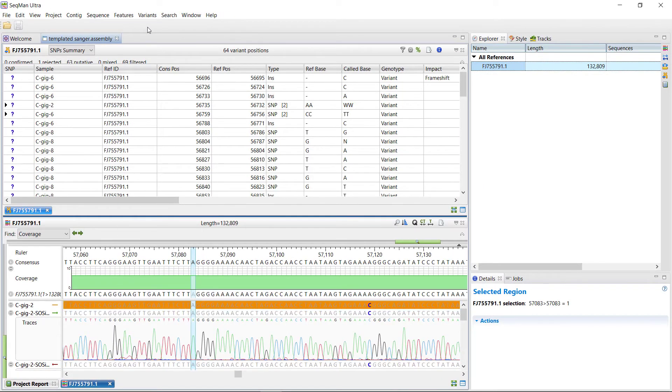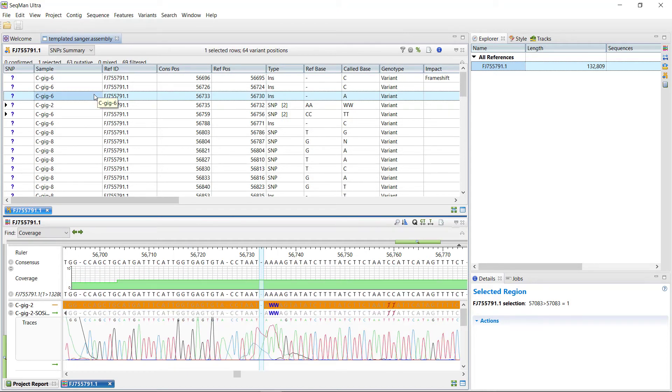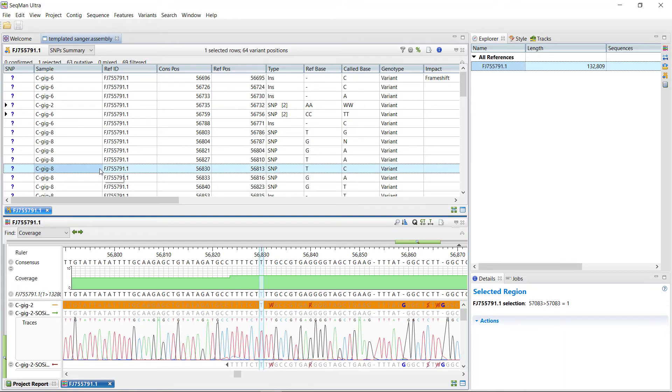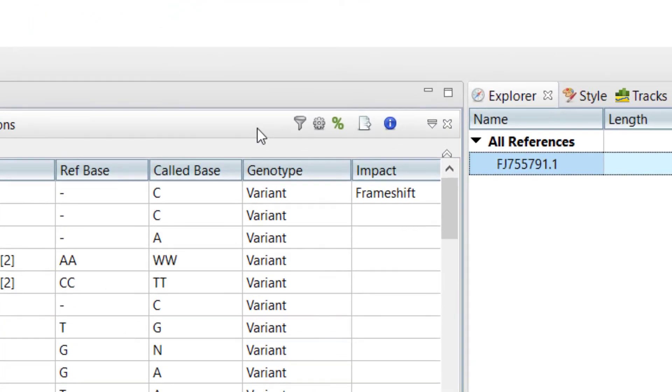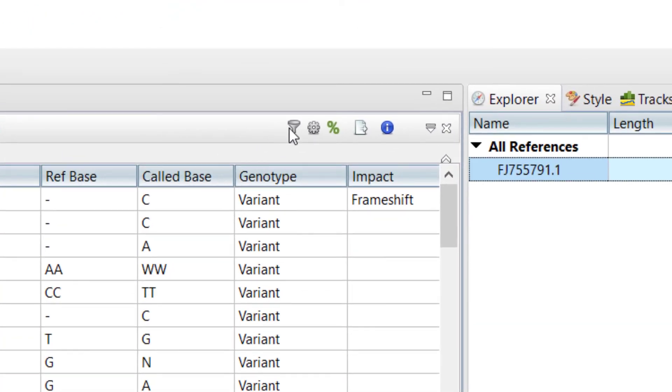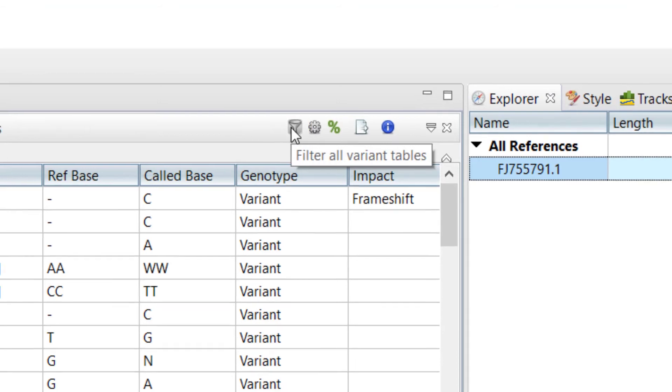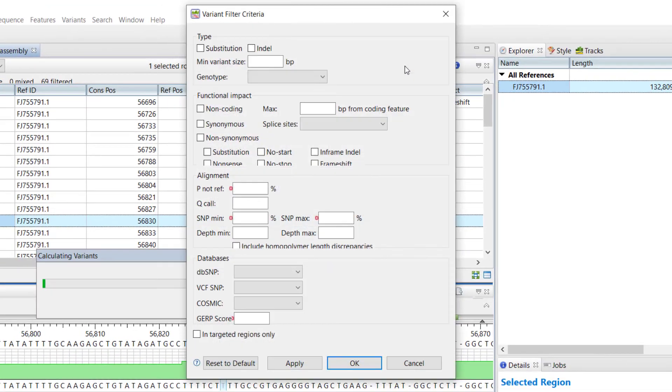This table is sorted by position and is interactive, so when you click on a variant in the table, the alignment view will jump to the variant selected. Note that the filtering options are also available for the variant table by selecting the Filter All Variant Tables tool.